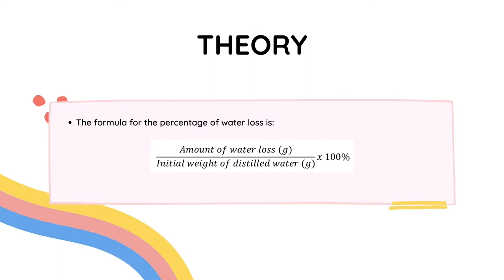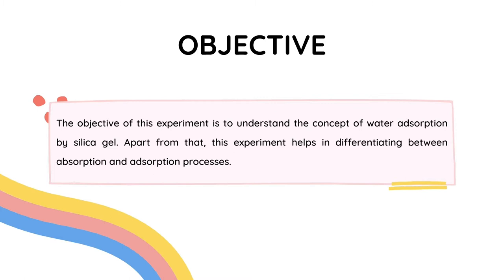This is the formula used in this experiment. The objective of this experiment is to understand the concept of water adsorption by silica gel. Apart from that, this experiment helps in differentiating between absorption and adsorption processes.